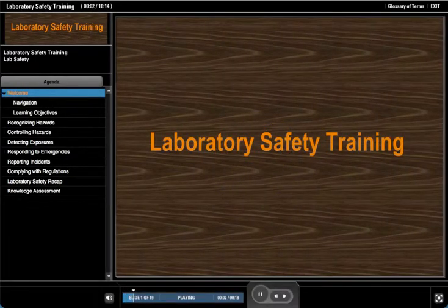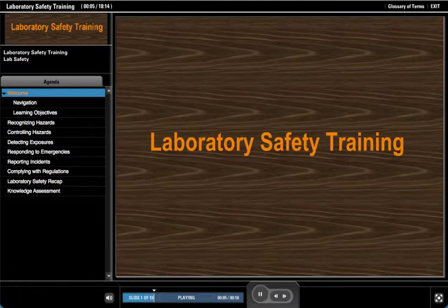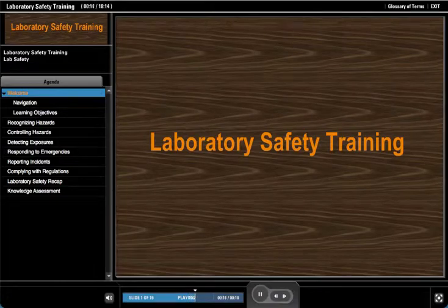Hello and welcome to laboratory safety training. This program will familiarize you with typical lab safety hazards and tips and methods to prevent them.